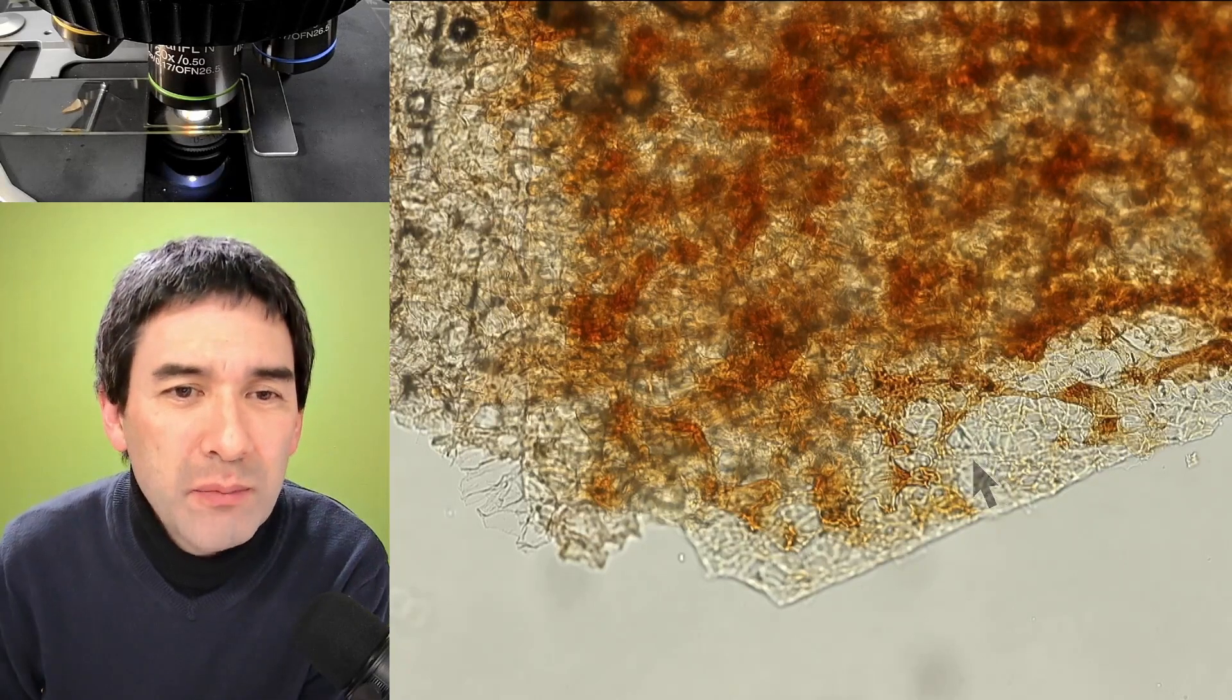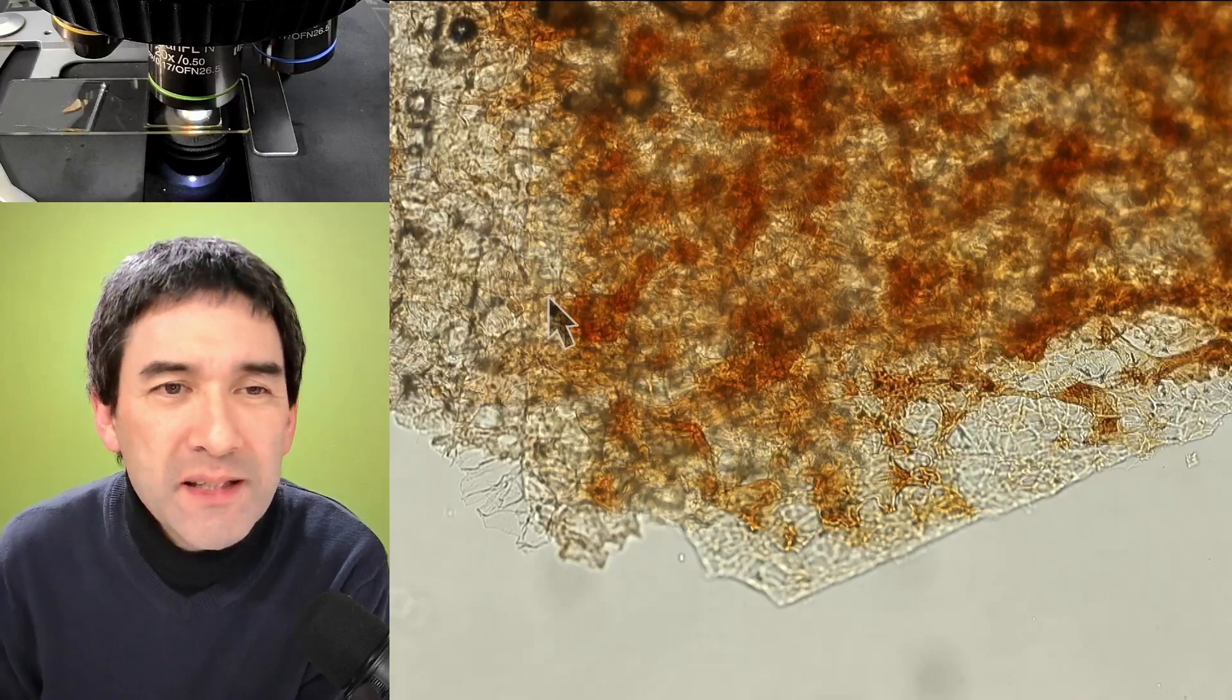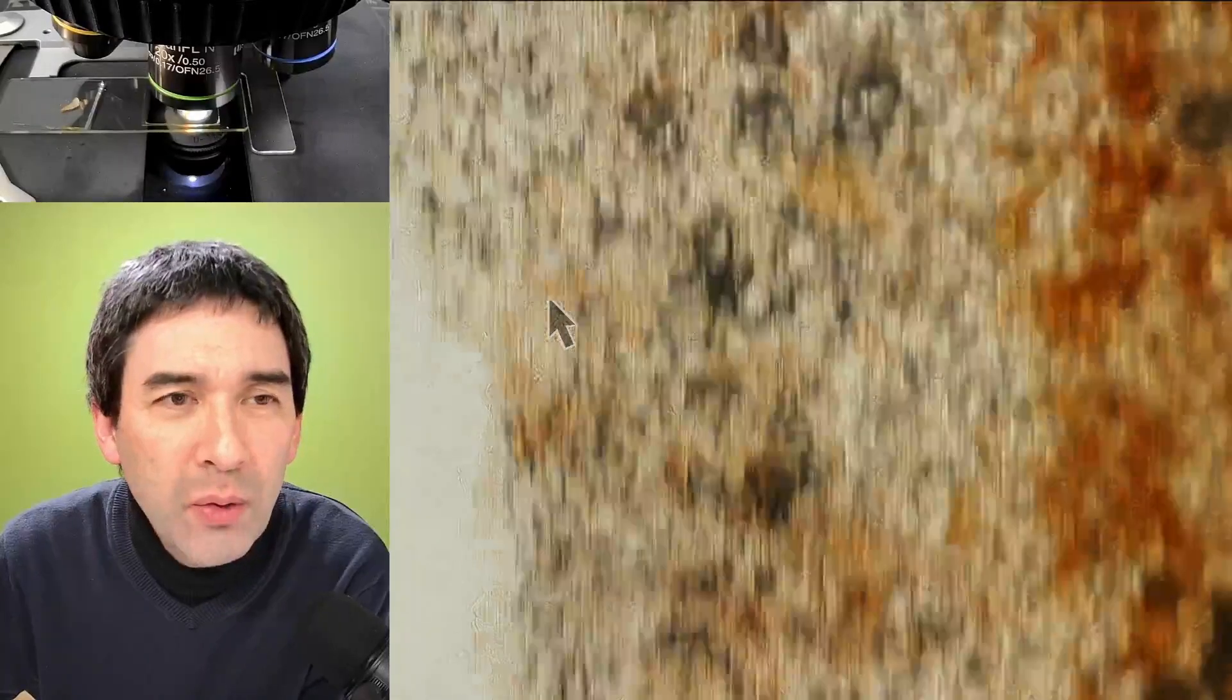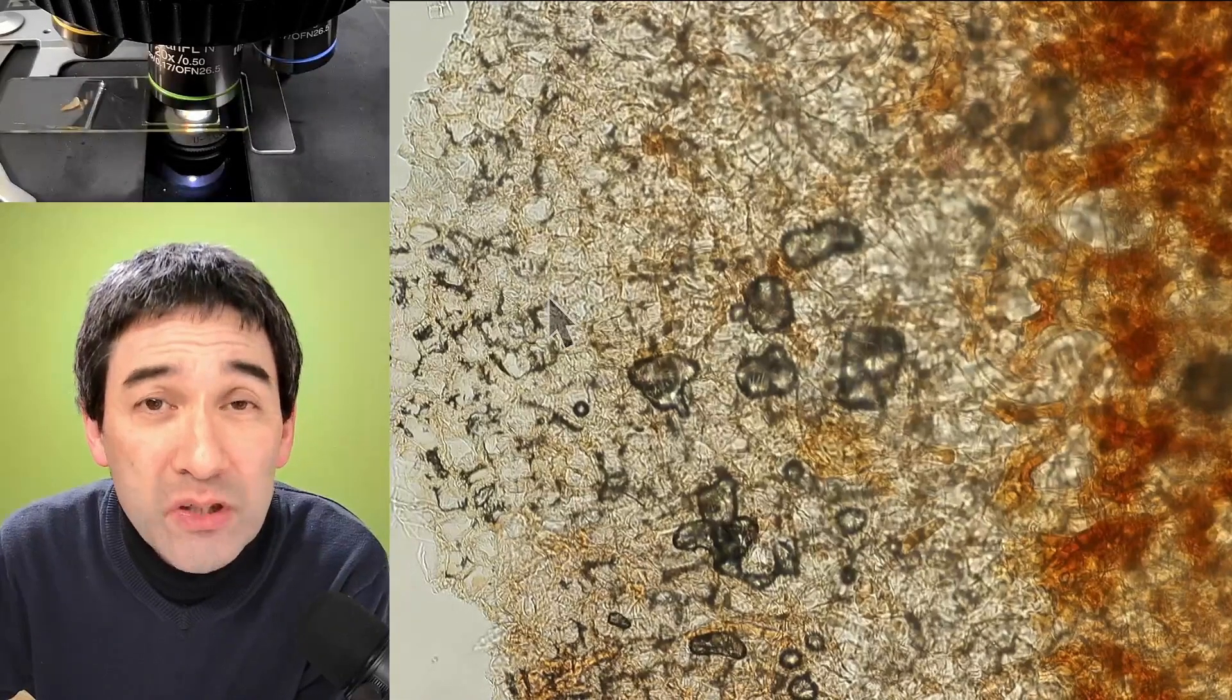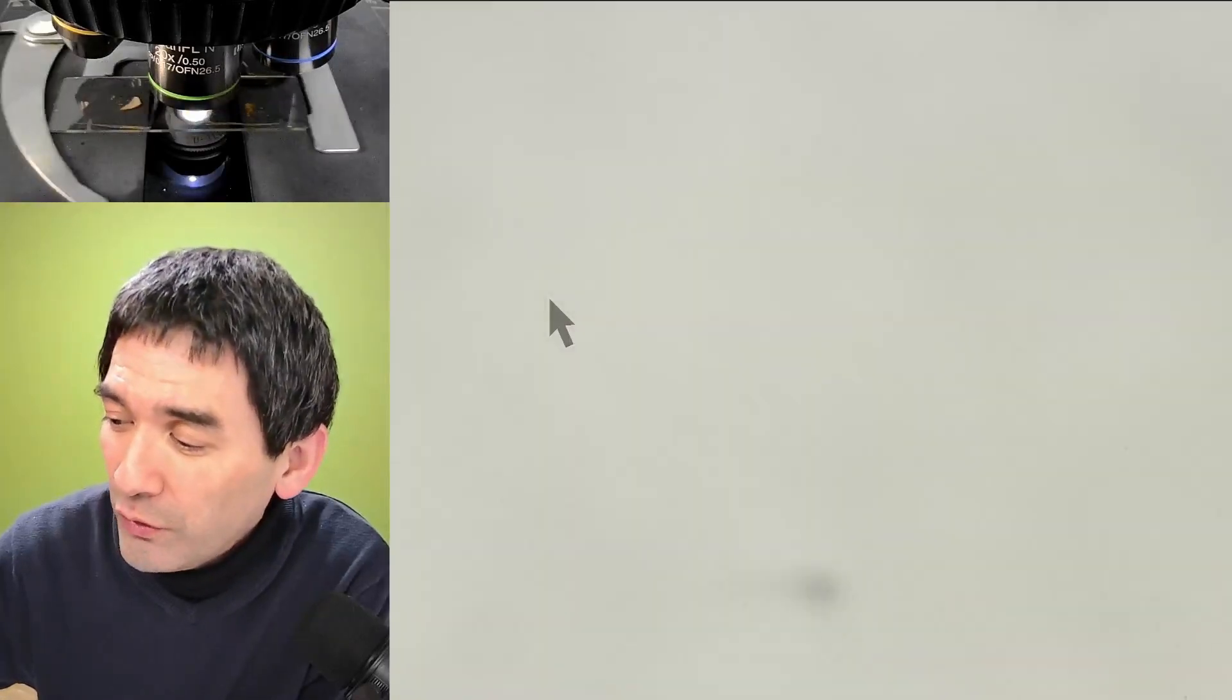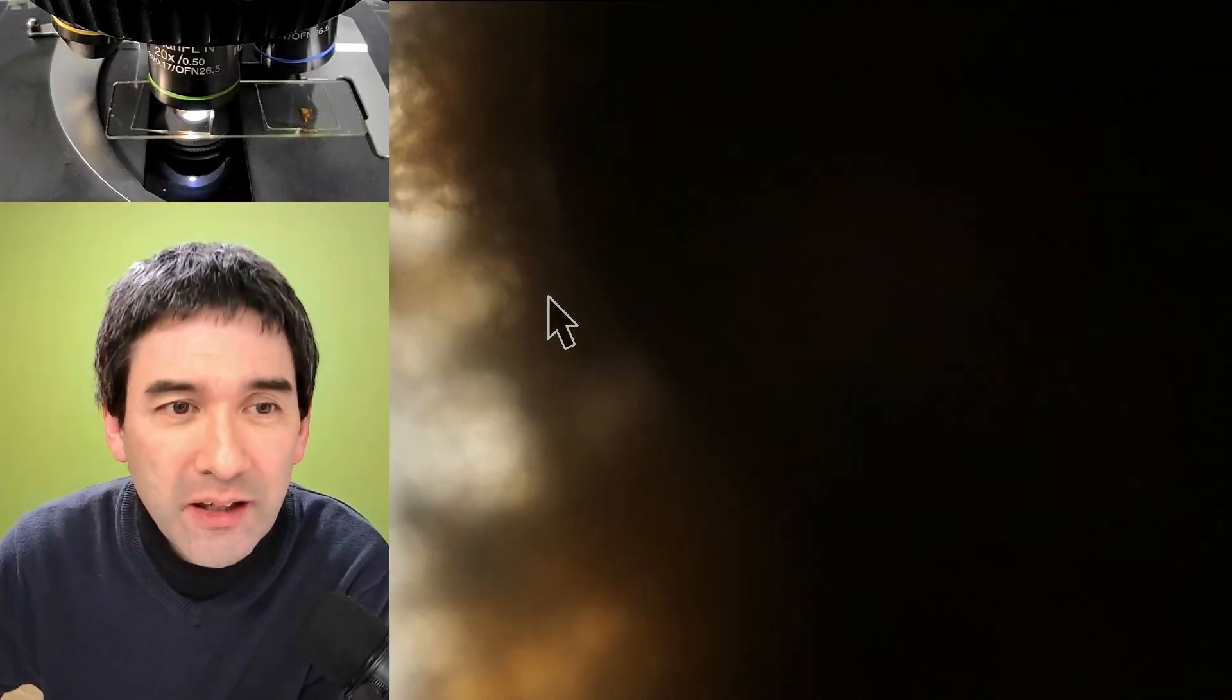But that's actually not the real important thing here. I'd rather would like to now show you how the specimen looks that's mounted in the PVA glue, the water-based glue. So I'm quickly going to move over. And look, this is how it looks like. Black.